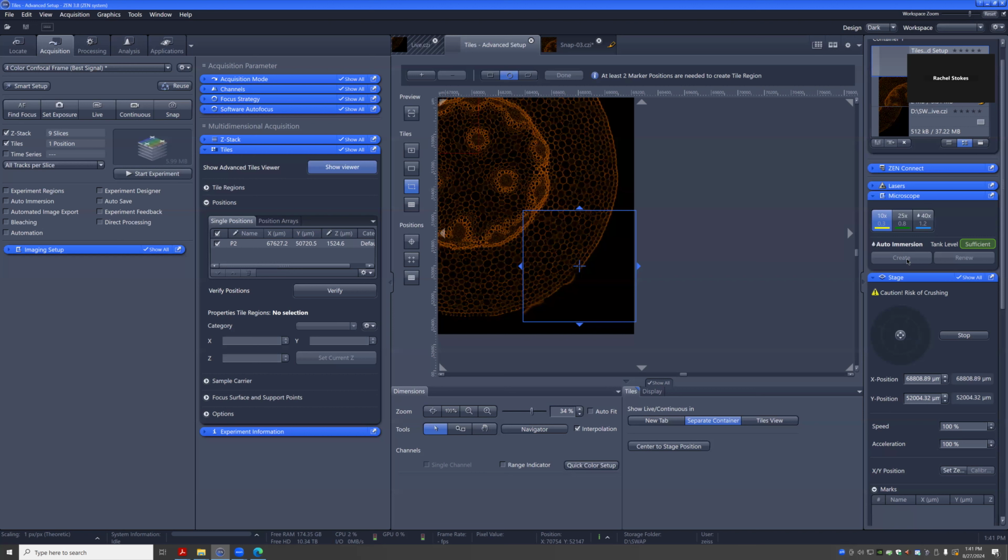Here, because we're usually imaging roots live, roots are full of water anyway. So they're full of water, you mount them in water. And everything's water. There are a few cases where we might have fixed samples, but even then, we usually mount them in water, or in some aqueous media, right? So we should optimize and set anything on the water setting. That's good to know. So we'll make sure we adjust that.